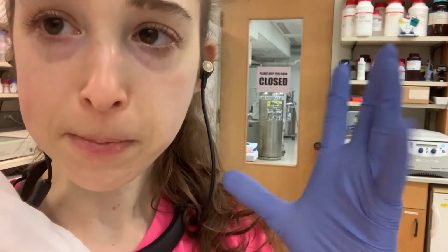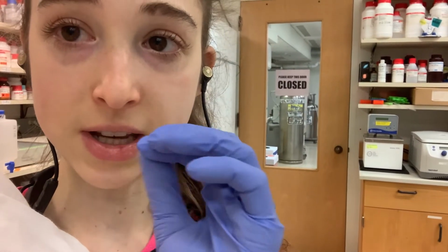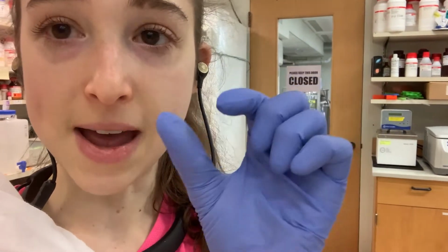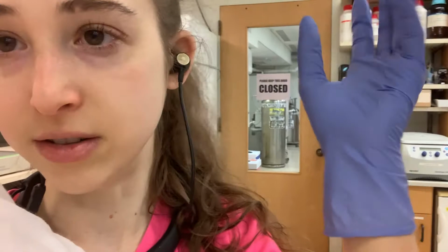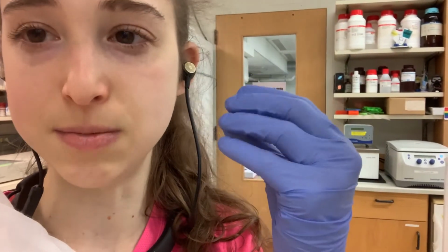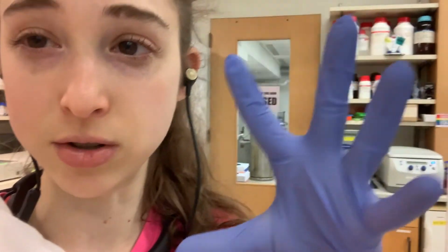With tris at a higher temperature, your solution is going to be more acidic, so it's going to have a lower pH. This is because the bond holding the proton onto the tris that it's going to donate has a higher enthalpy than the bonds that deprotonate for other buffers. What this means is that you have to put more energy in to get that proton to come off. And heat is energy.